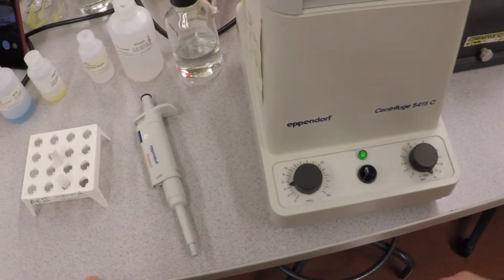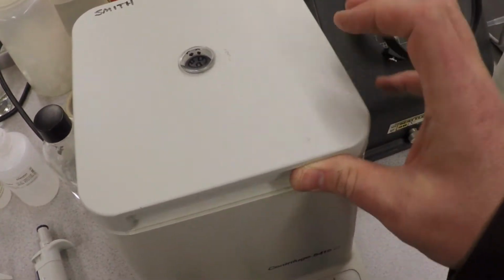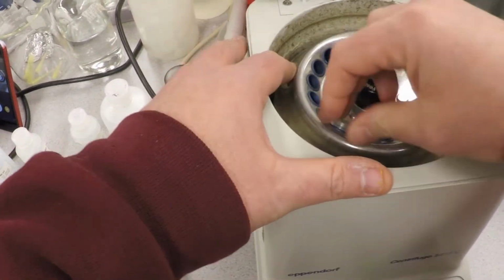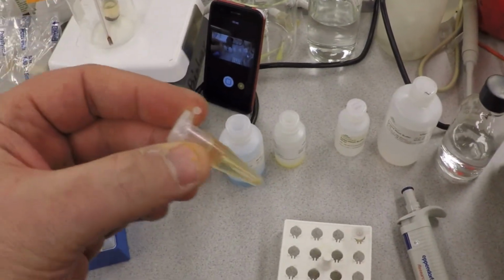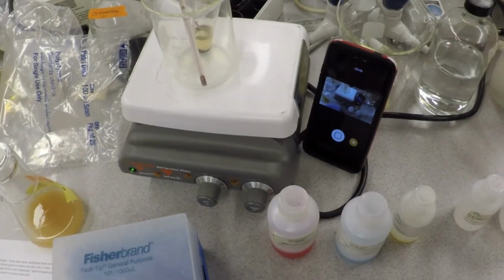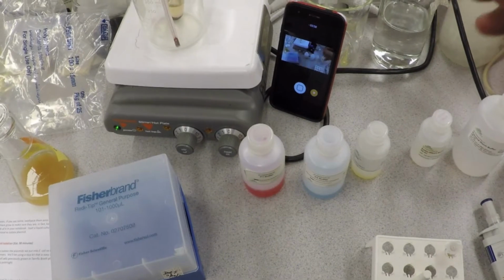That's probably enough. So we're going to turn off. And these centrifuges, just like the big one, they won't open until it comes down. You hear it click. There you go. And you can see that there's a little pellet in there. Okay? Now you've got to remove the supernatant. Because this is pelleted pretty strong, I'm just going to take this and shake it out into a beaker. You can very carefully remove that too if you're worried about it. But that pellet is pretty tight in there.